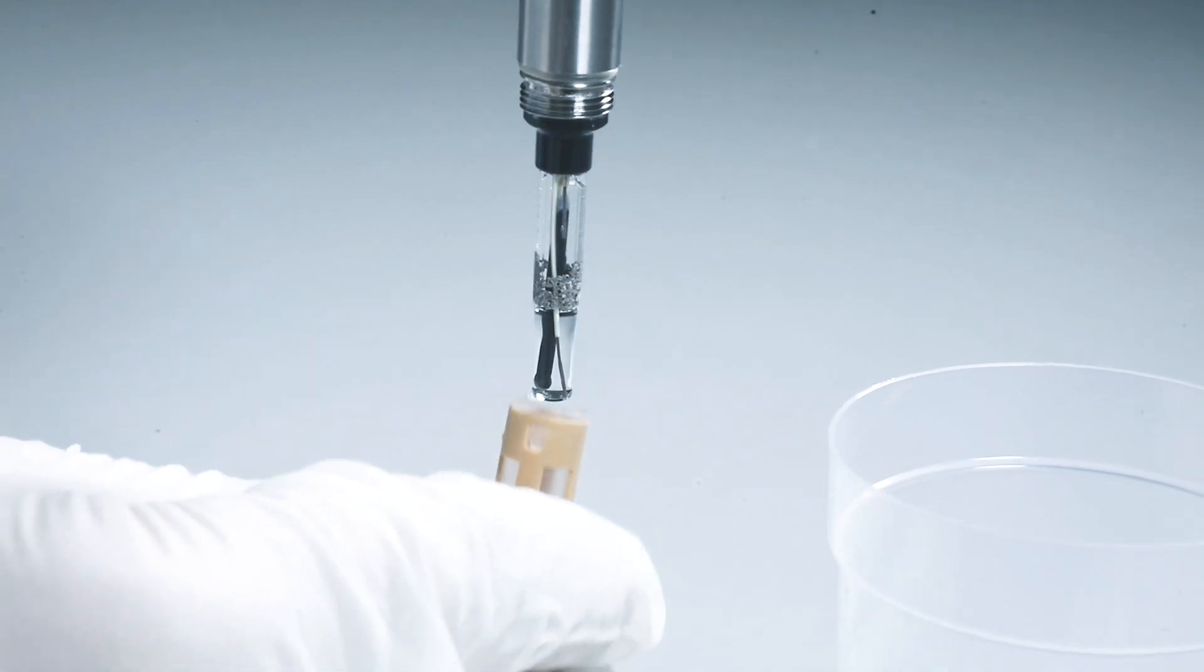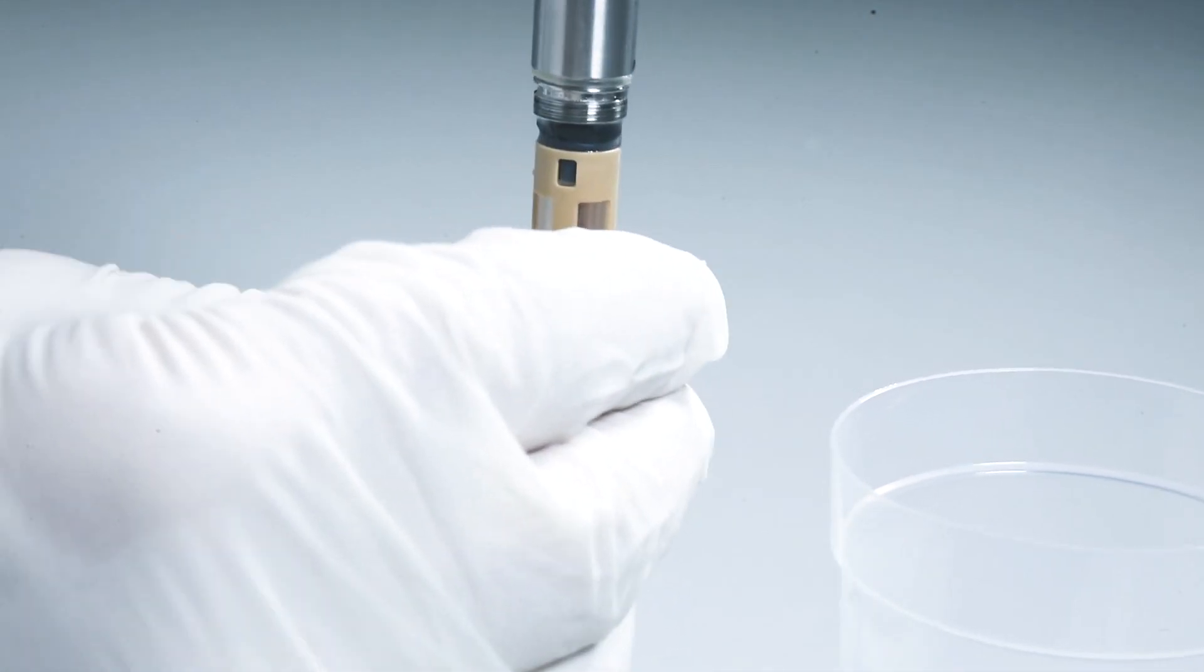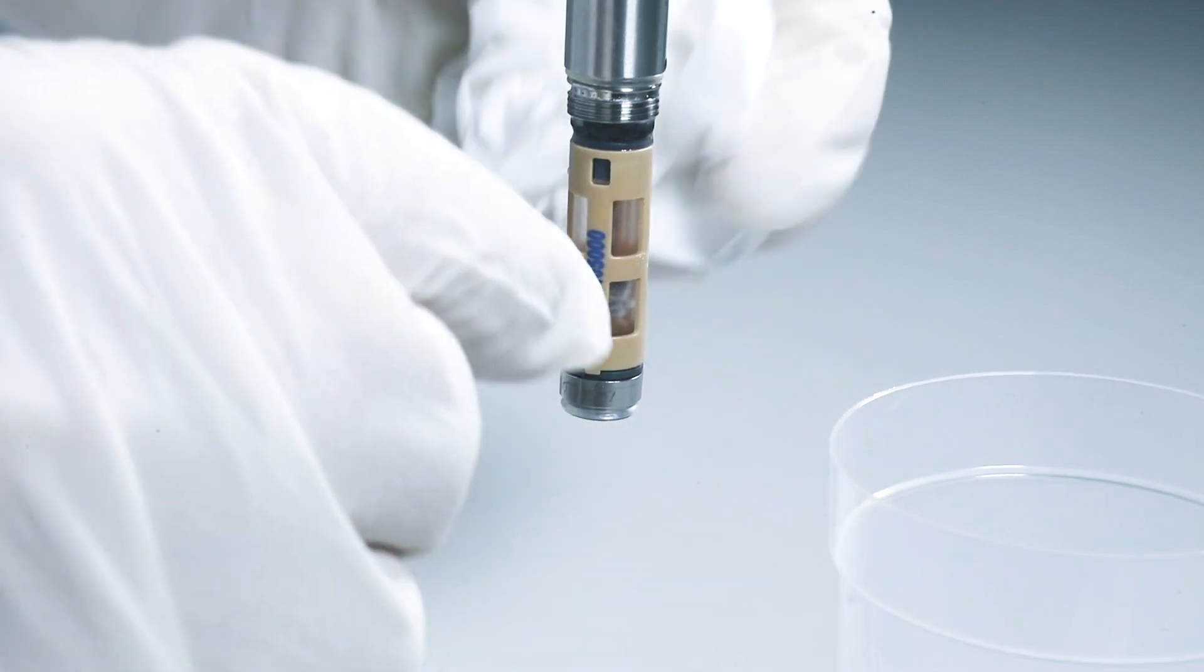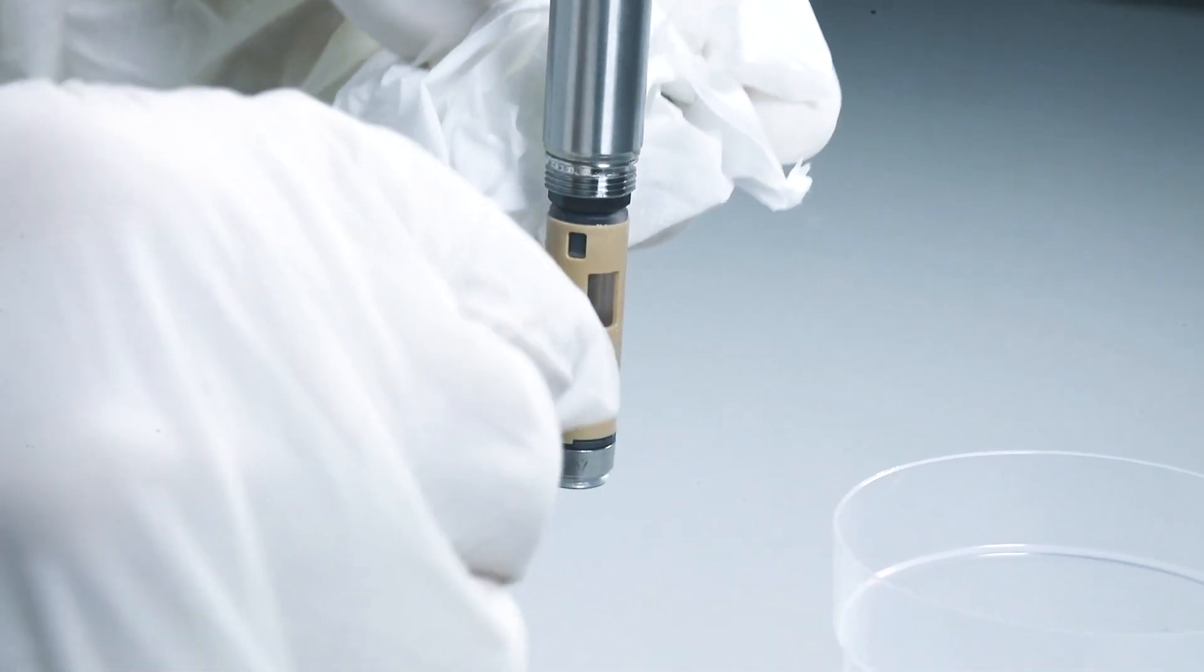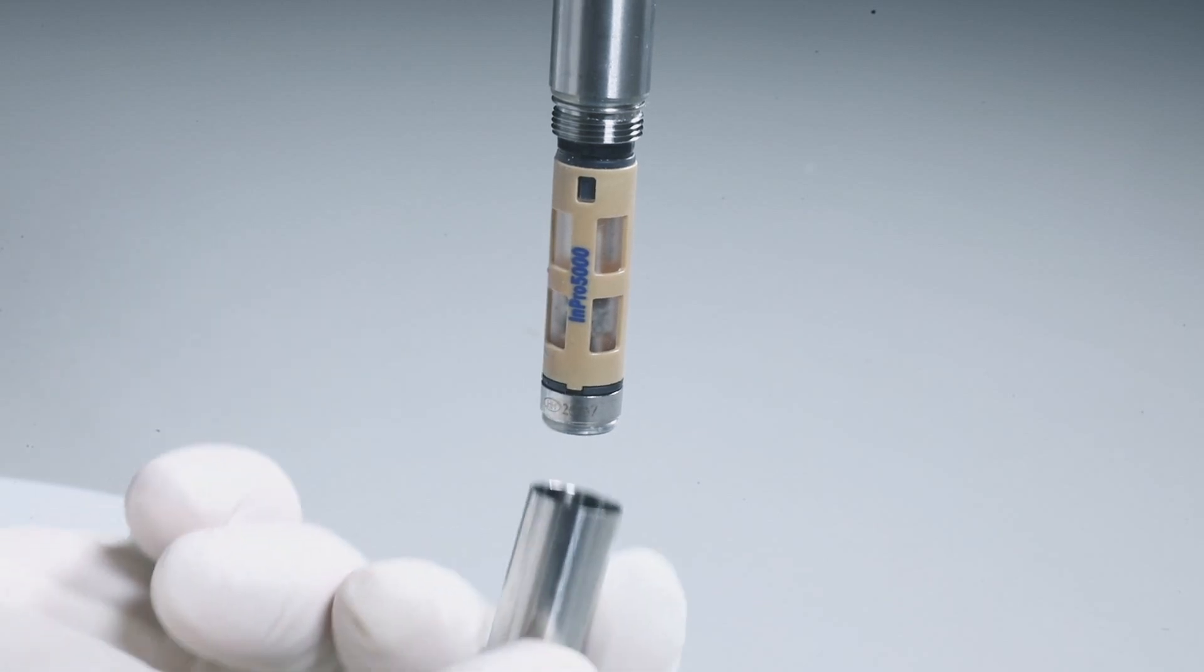Carefully push the membrane body onto the pH probe. Do not touch the pH probe's glass. With a tissue, remove any excess electrolyte. Reattach the cap sleeve.